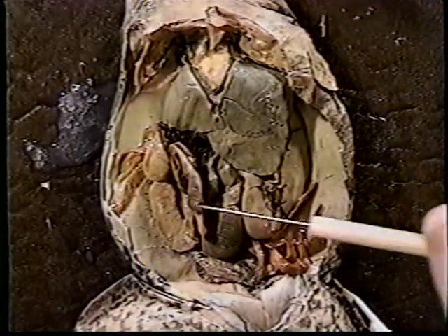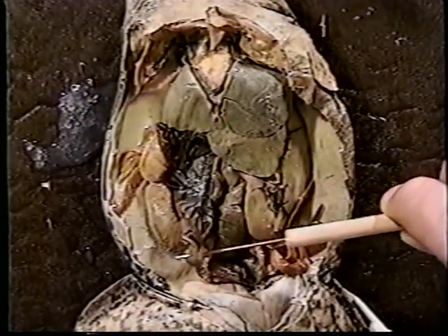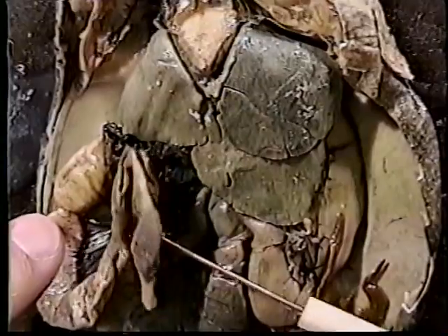As food leaves the stomach, it gets sent to the small intestine. The small intestine heads back up in a series of turns and twists. The reason for this is that the small intestine is very long and it would not fit within the frog if it were not coiled and turned.